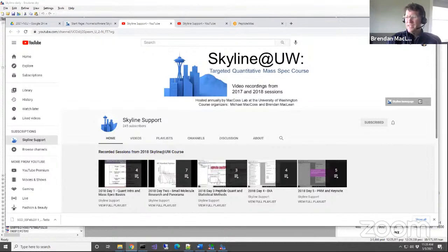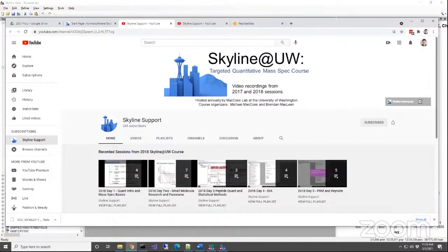We definitely discovered that there were some errors that could happen in Skyline that we wanted to make it so that they would stop MS Stats, so that MS Stats wouldn't even run. So it'd be more obvious that, hey, Skyline had an error. So that can be a problem. So I'd say first look up and see if you're totally positive that Skyline ran completely successfully, and then maybe look at the report and see what the report looks like.